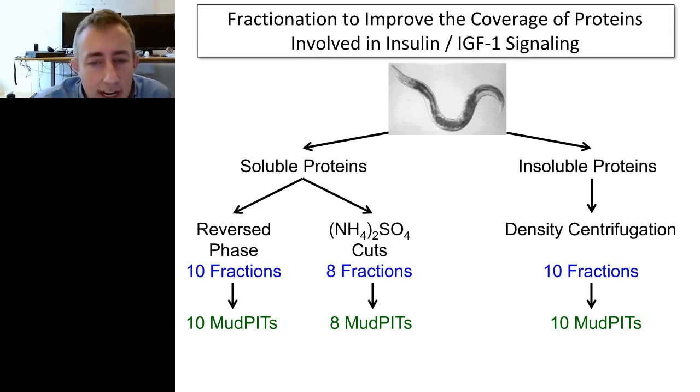So this is about 30 days of mass spectrometer time just for one sample. But again, we were kind of ambitious. We felt like we could work really hard and we'd be able to solve these problems.